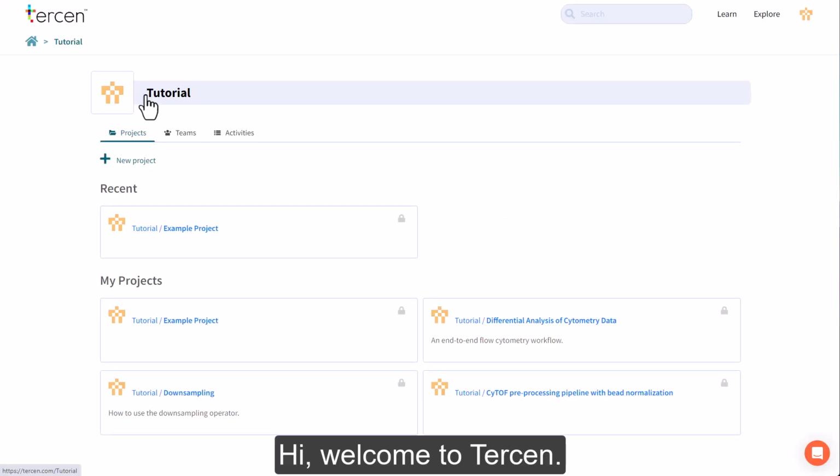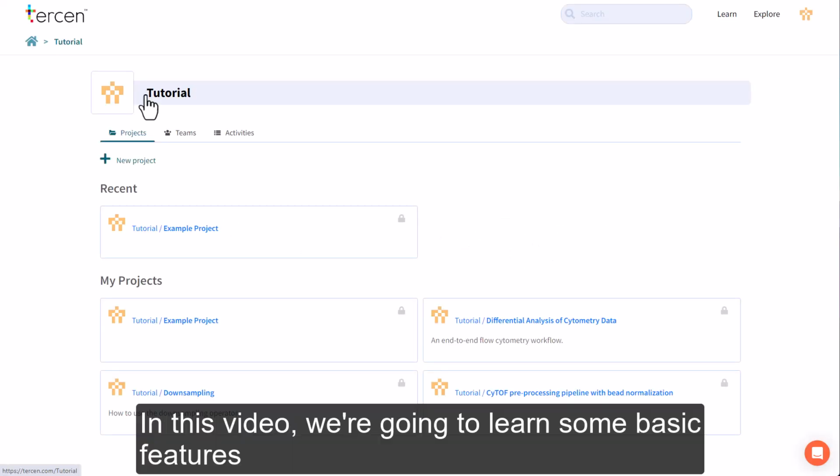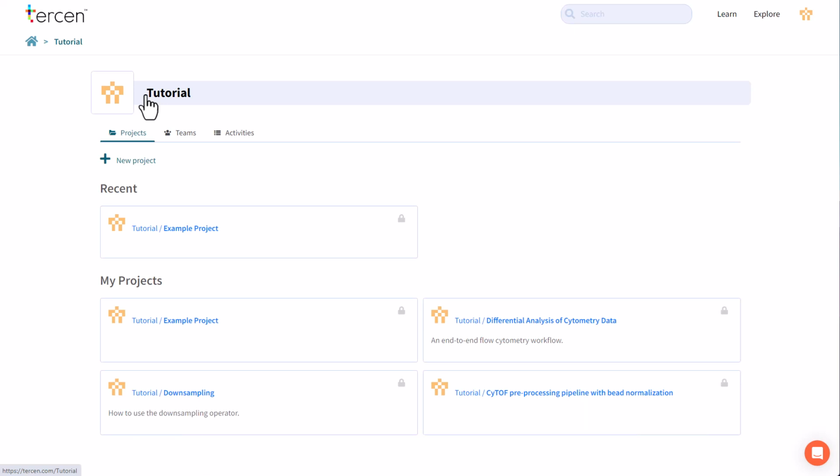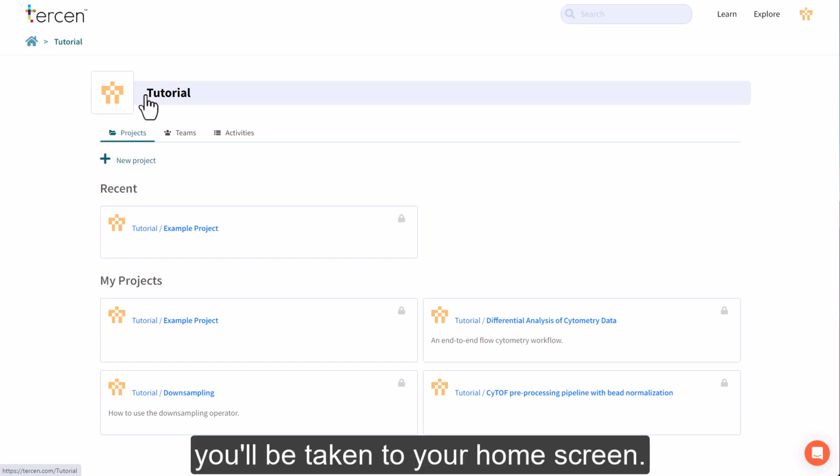Hi, welcome to Tercen. In this video we're going to learn some basic features and get started with data analysis. First, let's orient ourselves. After you've signed up for Tercen, you'll be taken to your home screen.